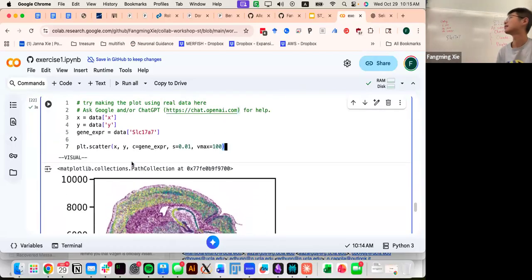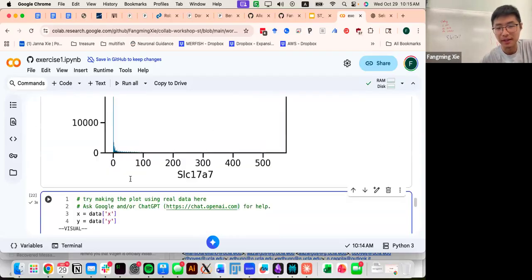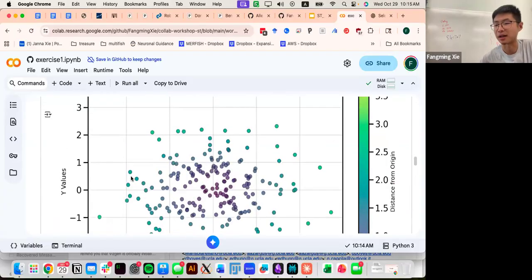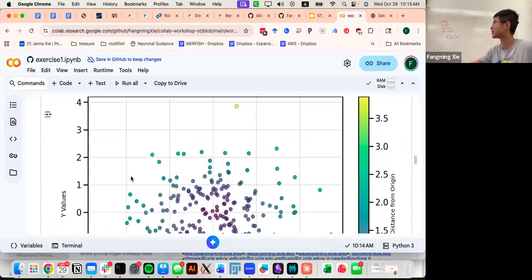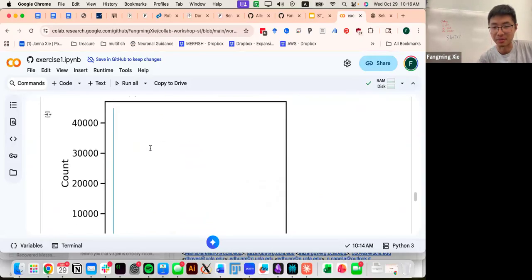Okay. And then you may worry about all the decoration. Can I add a title? Can I add a sidebar showing the color map and all these things? AI will do those for you. You just ask. For example, in that plot, we just asked it to generate, and it already provided a color bar and everything. You just figure out which line controls the color bar, which line controls the title, and so on, right? And if you're unsure, you can always ask back and forth.